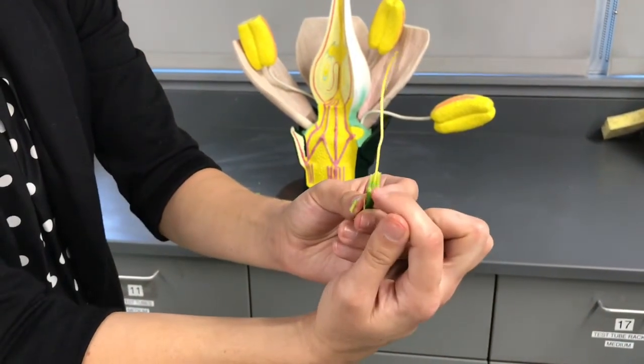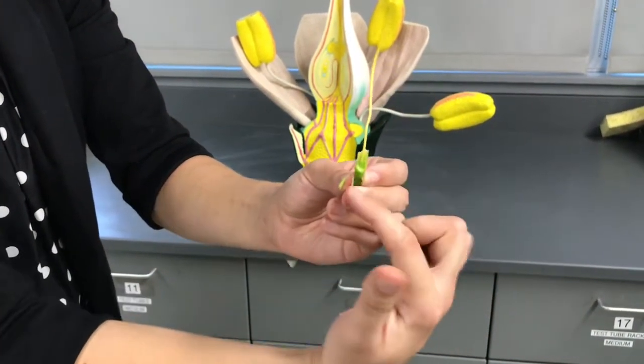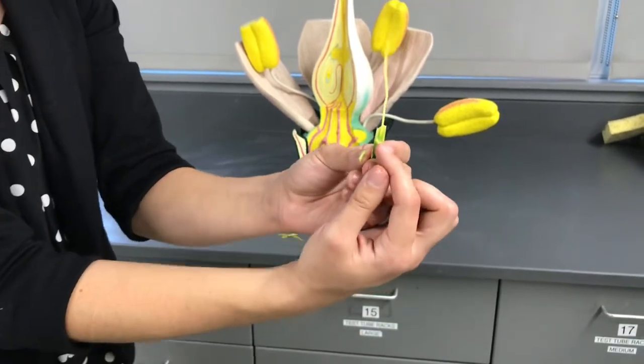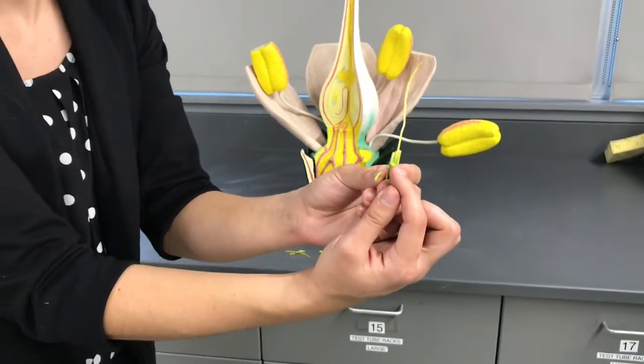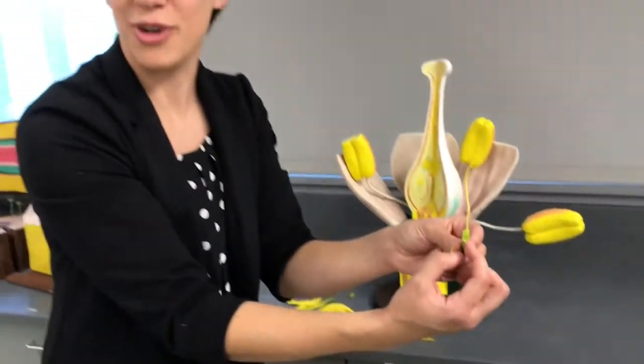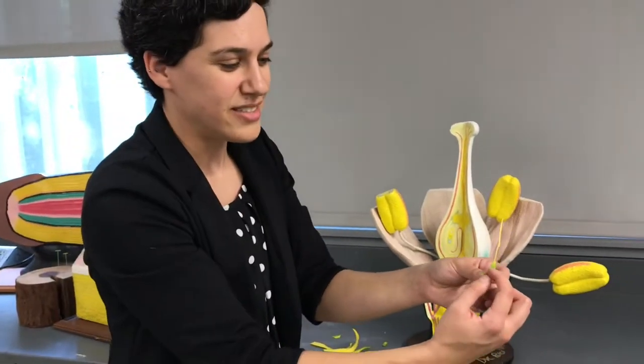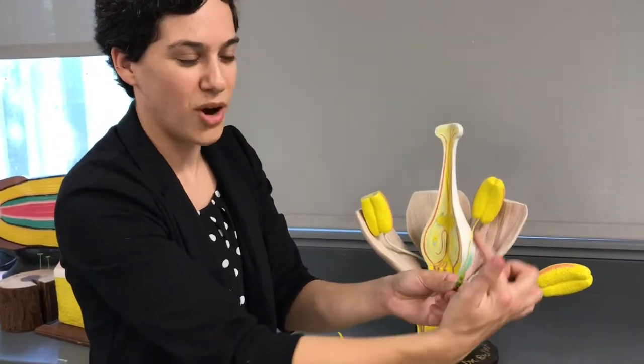That green bulb at the very bottom of this carpel is called the ovary. And that's where the seeds will be made once this flower has fertilization occur.